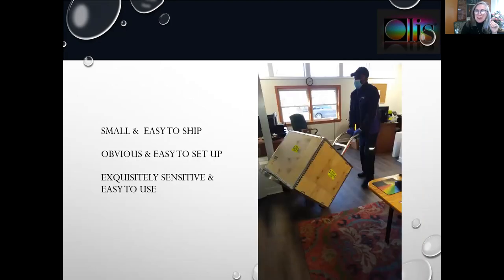This picture is fun — literally the entire instrument is inside of this crate. This includes the instrument, the electronics, the computer. Small and easy to ship, obvious and easy to set up, and most importantly, exquisitely sensitive and easy to use.